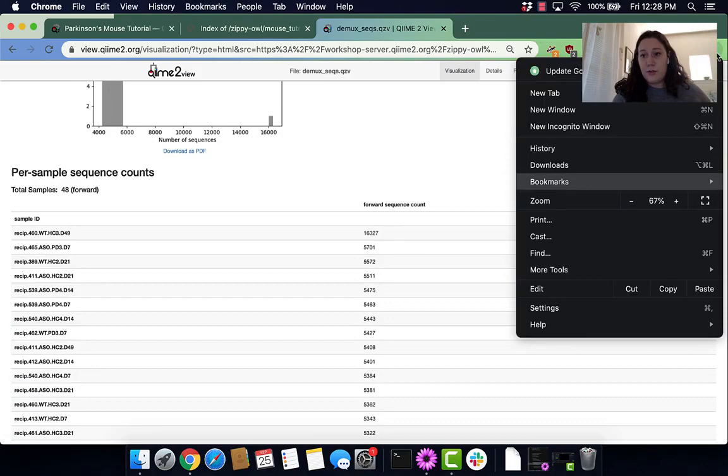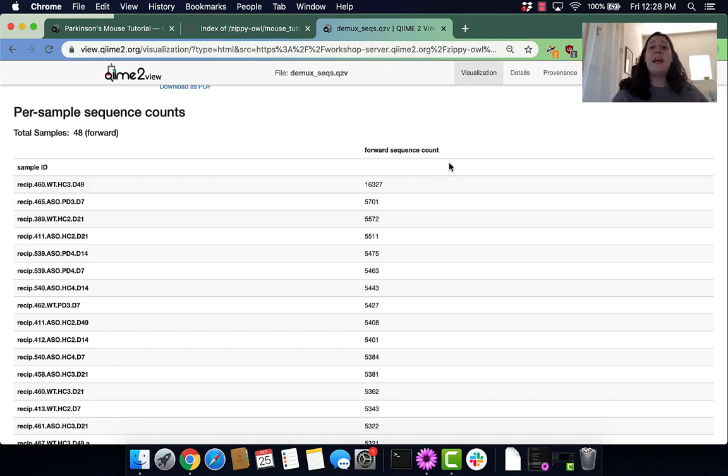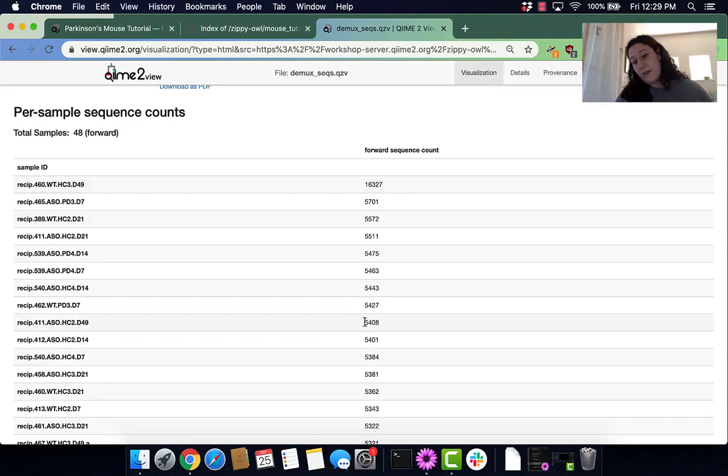Then you can see that in more detail. Here we can see the sample ID and the amount of sequence counts for that sample ID. For instance, this sample has the 16,000 sequence counts, while this sample has 5,408 sequence counts.